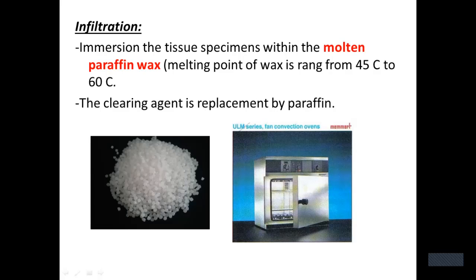This is very important when selecting the wax from any shop. This must be done inside the oven.